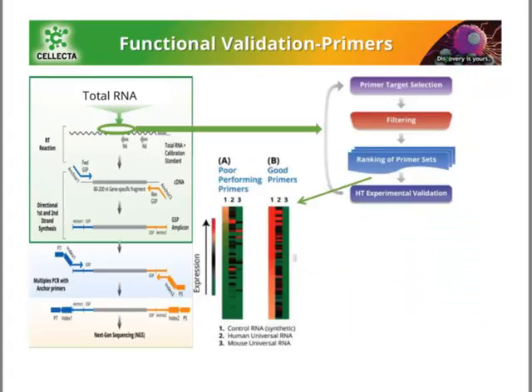So having said that, for those of you who are very familiar with RT-PCR techniques, the biggest challenge or the biggest aspect of developing a platform is looking at primers. It's no easy task, and it's also something that has kept us very busy for the past 1.5 years. That is the biggest component of how we developed this assay. There is a design aspect to it. There's also a functional validation.